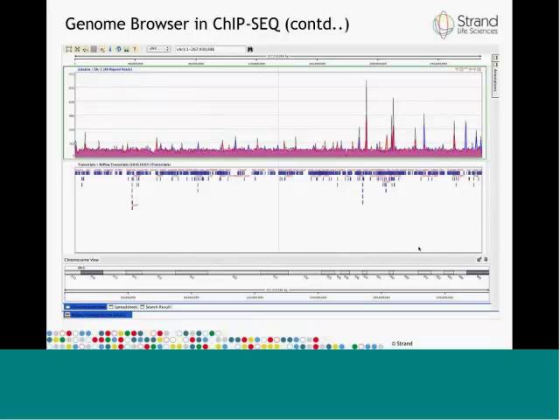Note that unlike the DNA-seq and RNA-seq experiment, the default view in the ChIP-seq experiment shows forward coverages, reverse coverages, and the total coverage. All of these are shown in distinct colors, and the total coverage is shown with a thin black line. The idea here is that in a ChIP-seq experiment, one is largely interested in looking at the peak regions where the forward and the reverse coverage are expected to be slightly separated by the size of the binding region itself.